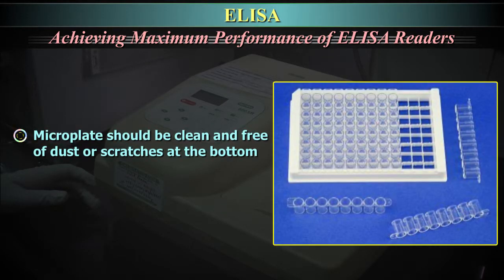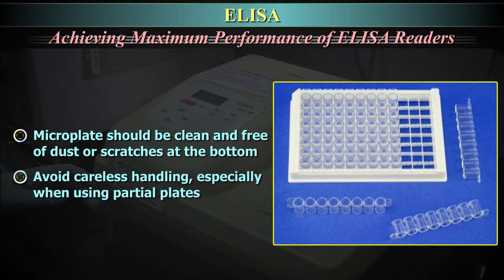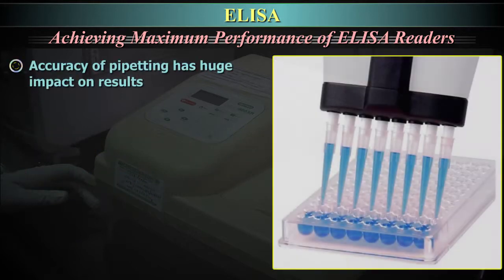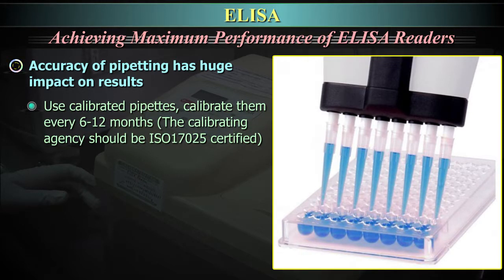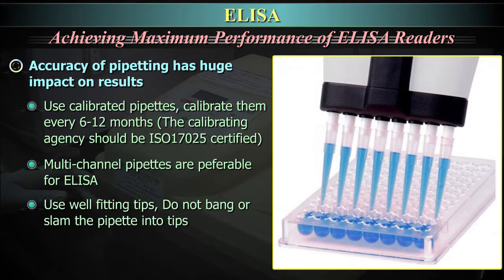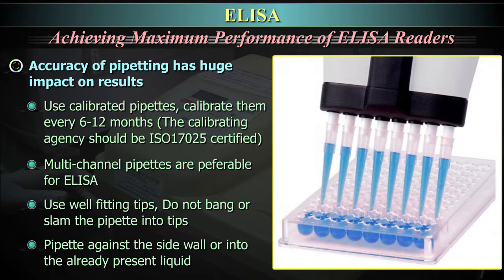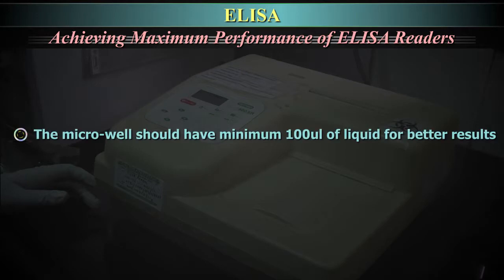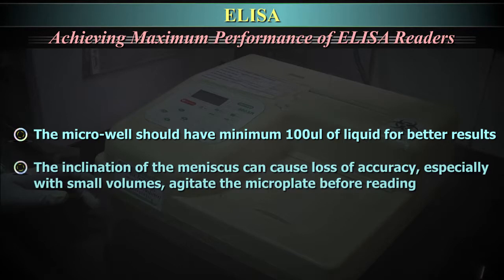Microplates should be clean and free of dust or scratches at the bottom. Avoid careless handling, especially when using partial plates. Accuracy of pipetting has a huge impact on the results. Use calibrated pipettes and calibrate them every 6-12 months. The calibrating agency should be ISO 17025 certified. Multi-channel pipettes are preferable for ELISA. Use well-fitting tips; do not bang or slam the pipette into the tips. Pipette against the sidewall or into the already present liquid. The micro-well should have a minimum of 100 microlitres of liquid for better results. The inclination of the meniscus can cause loss of accuracy, especially with small volumes; agitate the microplate before reading.